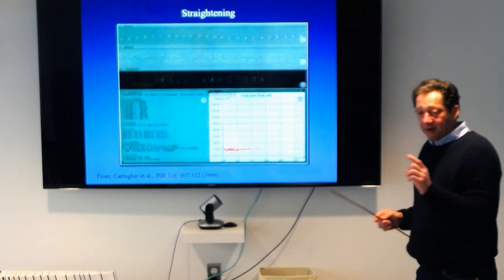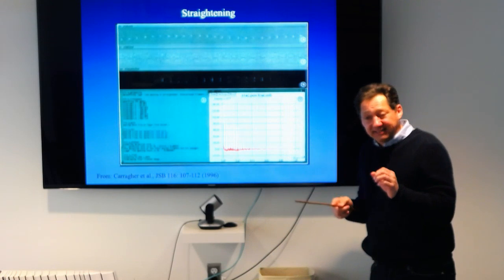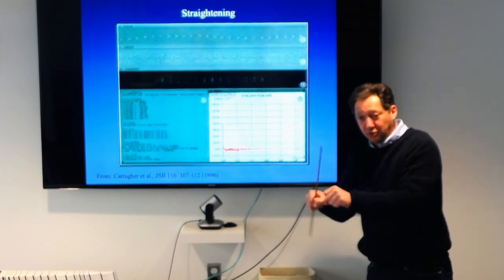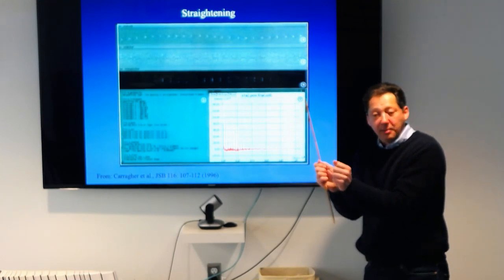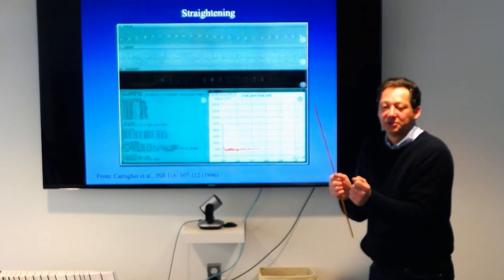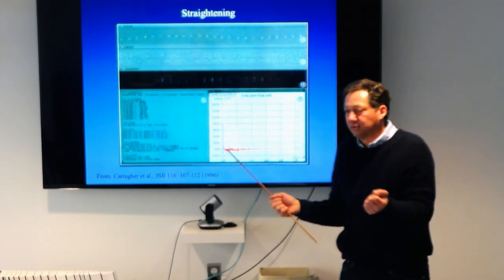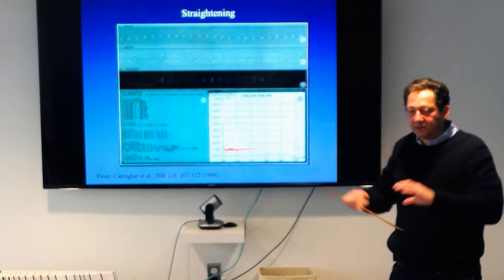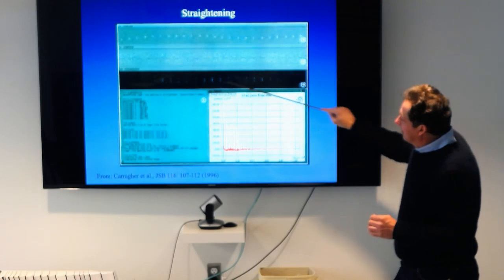But nevertheless, what those also indicate is that if your protein itself is very, very flexible, you really need to do that even when you select your single particles. If you're doing a single particle approach, you're probably not going to get a lot of resolution because your particles are very distorted. So the straighter your particles, the better. Okay? So anyway, that was the procedure.